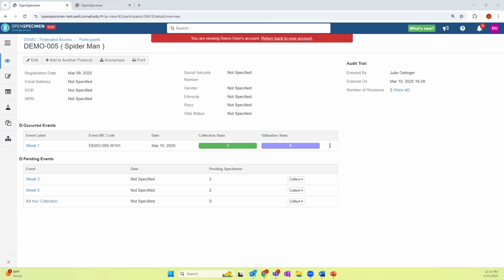So when folks start collecting specimens, they create a collection protocol. So individuals who are associated with that collection protocol are able to be provisioned access. You have to submit a request to obtain access to OpenSpecimen regardless. So yes, it does limit who can see the specimens and the associated data pertaining to those specimens to only those who have access. Thank you, Colin, for fielding that one.